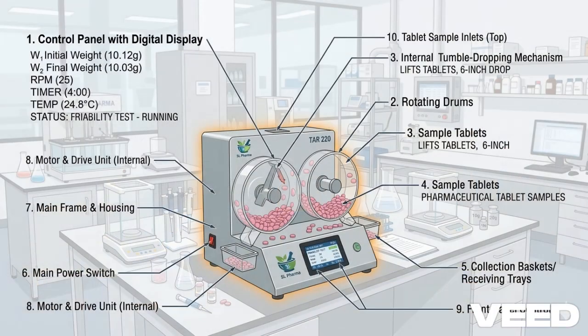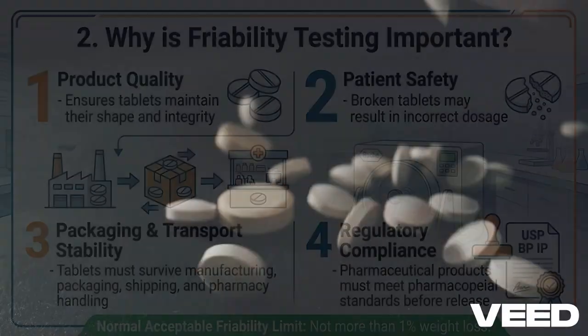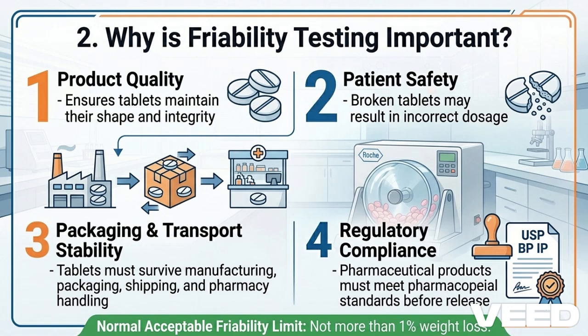Now let's look at why friability testing is important. First, it helps ensure product quality. Tablets must maintain their shape and integrity until they reach the patient. Second, it ensures patient safety. If tablets break or lose powder, the patient may receive the wrong dose.